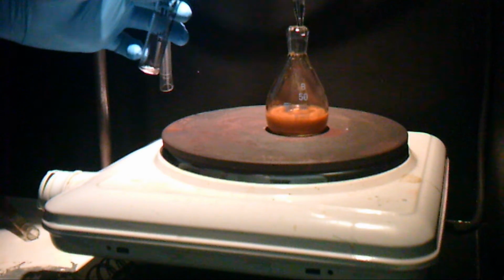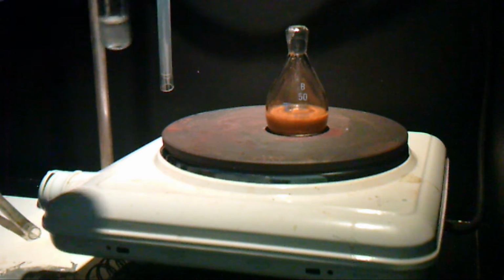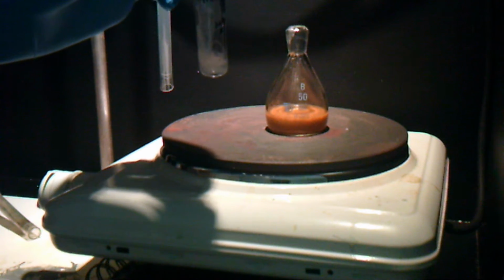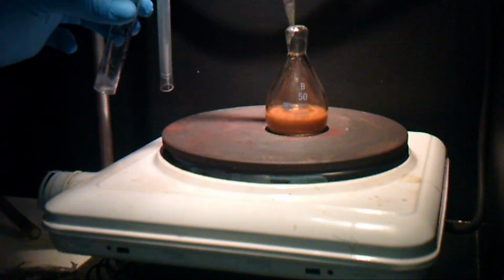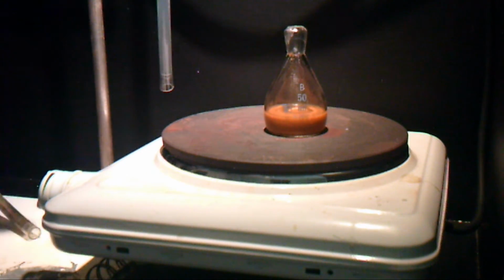Now we put the last of the para-iodoaniline. We wash the vial with small amounts of water and we put it back in the mixture.